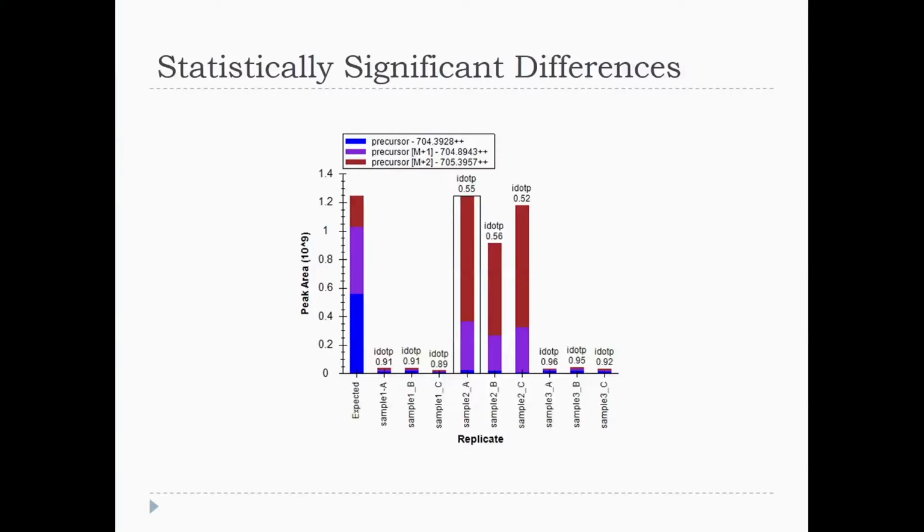Isotopic, like, wow, these are 0.9s, those are great matches. The isotope dot P talked about is a correlation score that tells us how well we're matching to the expected isotope distribution. And these guys are at 0.5. The library dot P that Ludovic presented, a 0.8 is kind of okay. You should expect 0.9 and above. I guess this is 0.89. But the isotope distribution dot Ps should be very, very good, and this is not very good. So we can guess, even before we look at the chromatograms, something's wrong. This is probably some weird interference.